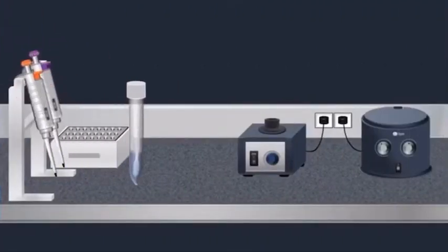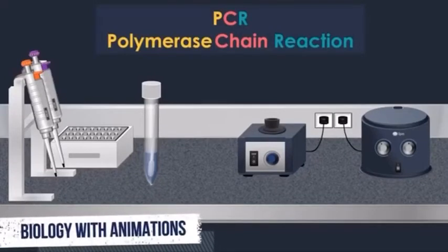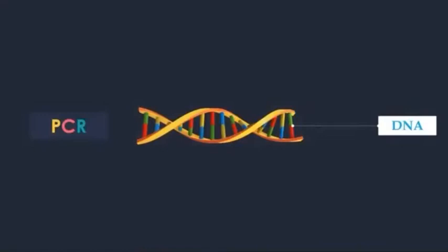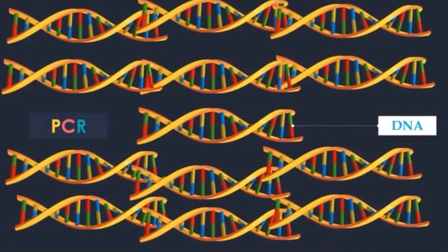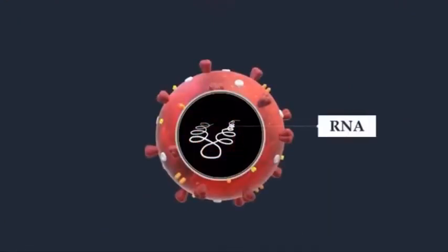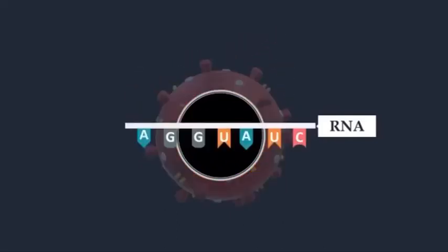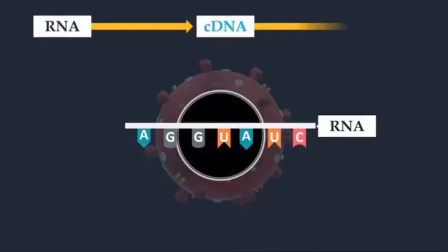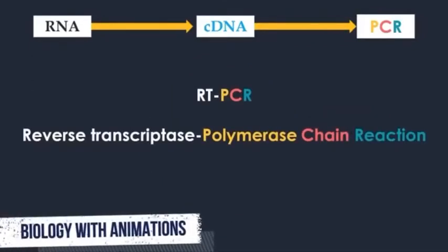The standard method of coronavirus testing is polymerase chain reaction (PCR), which is a method used widely in molecular biology to make millions to billions of copies of a specific DNA fragment rapidly. Coronaviruses contain an extraordinarily long single-stranded RNA genome. To detect these viruses with PCR, RNA molecules must be converted into their complementary DNA sequences by reverse transcriptase. Then the newly synthesized DNA can be amplified by standard PCR procedures. This approach is universally known as RT-PCR.